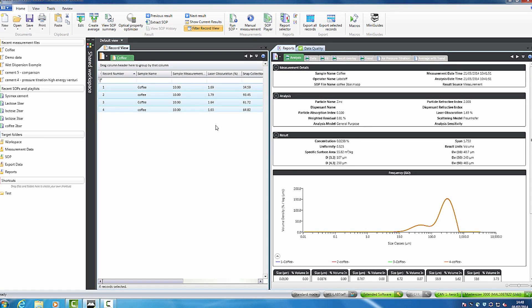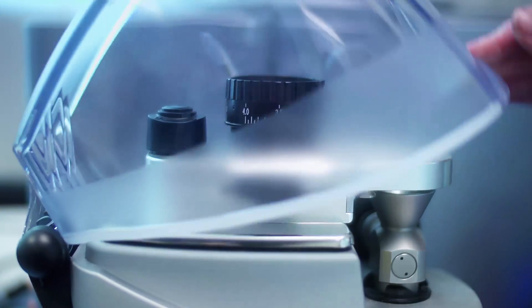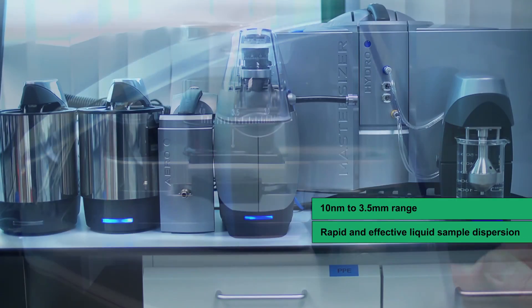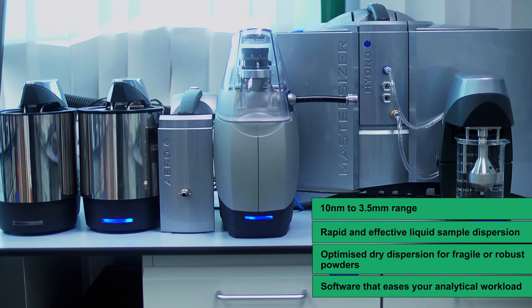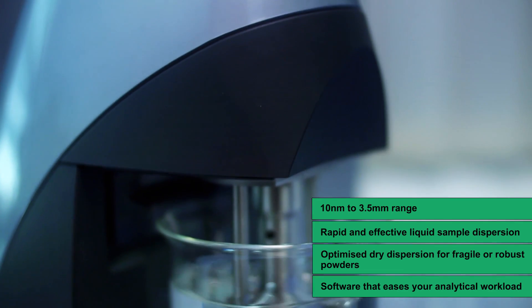Here, any number of sample reports can be stored, enabling you to report the particle size parameters which fit best with your application. From research and development through to routine QC measurements, the Master Sizer 3000 is the workhorse particle sizing system for your lab.